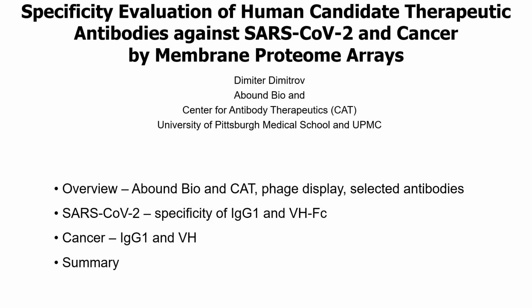Thank you, Tim. I am Dimitar Dimitrov, Chief Scientific Officer of Abound Bio, Director of the Center for Antibody Therapeutics. First of all, I would like to thank the organizers for inviting me. I'll talk initially about our company and our Center for Antibody Therapeutics at the university, then about our platform features, phage display, and some selected antibodies. And then I'll give you examples of how membrane proteome arrays helped us to characterize our antibodies against SARS-CoV-2 and also some antibodies against cancer.